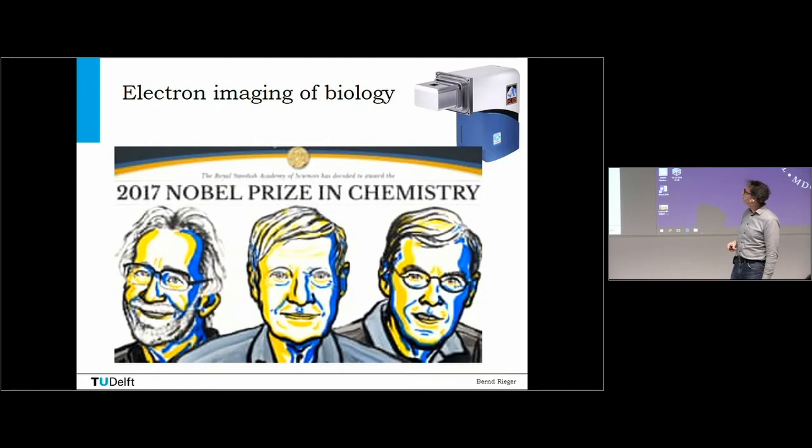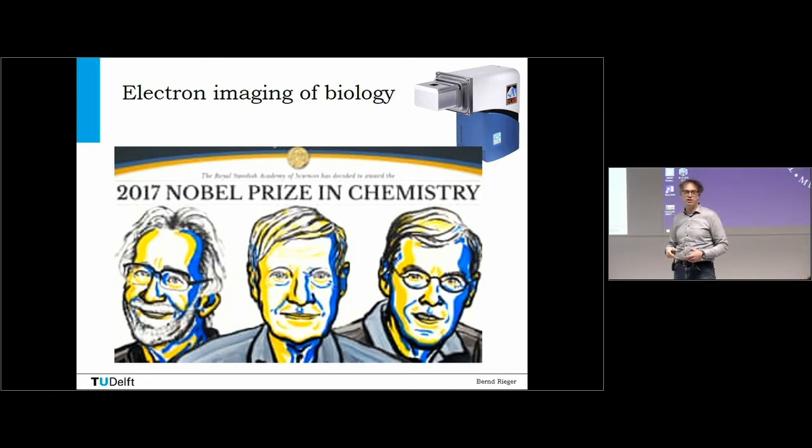And then in the field of electron imaging, just two years back, the Nobel Prize was given to three gentlemen, plus the invention of this camera that you see here. That's a much more sensitive camera than you had before. Together, in this field too, the data that you acquire increased a lot, because the cameras became larger, more sensitive, faster, and you had the benefit of automatization.